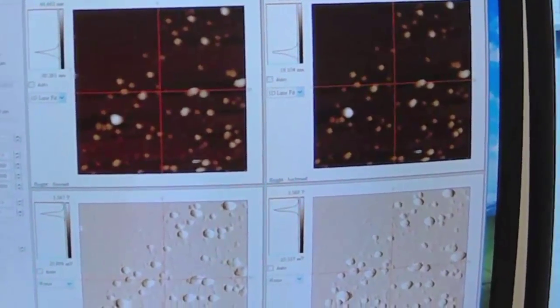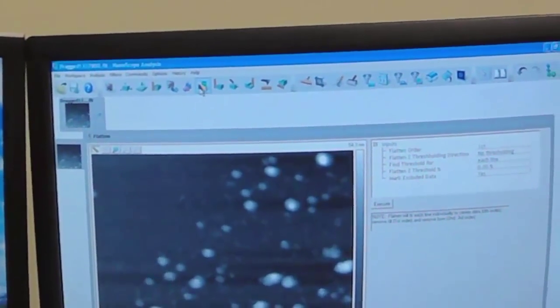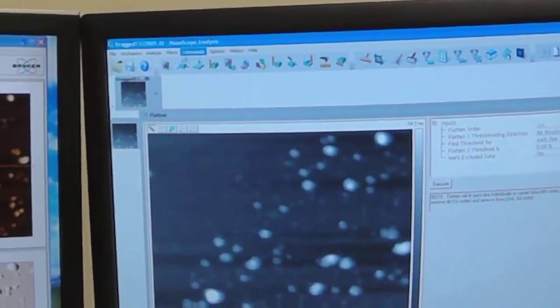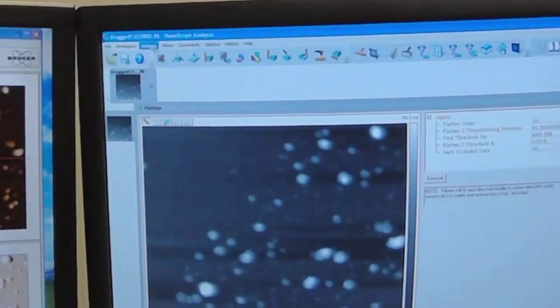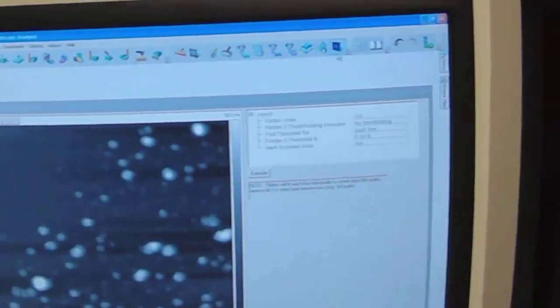So here is the same image we saw here, except instead of this orange-red contrast, we have it in grayscale. You can change the contrast colors and do analyses, all kinds of tools up here.